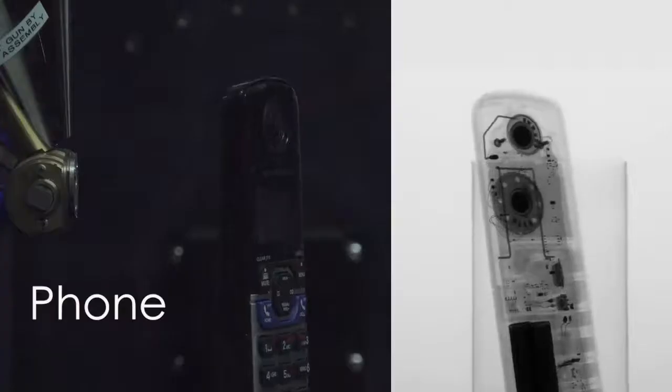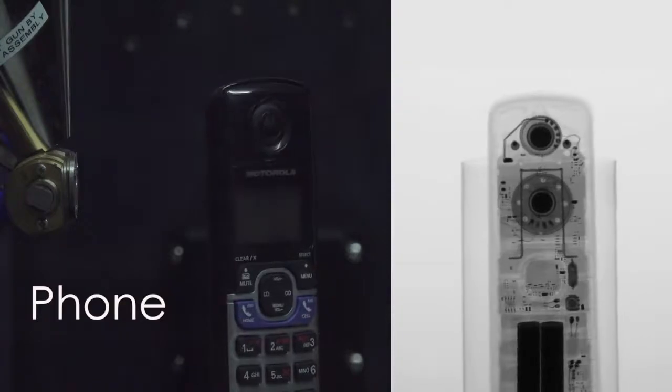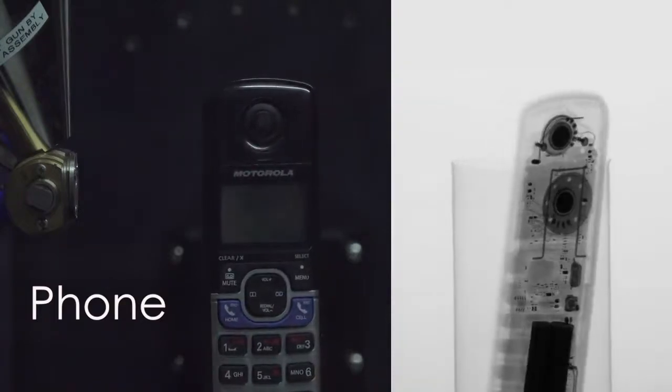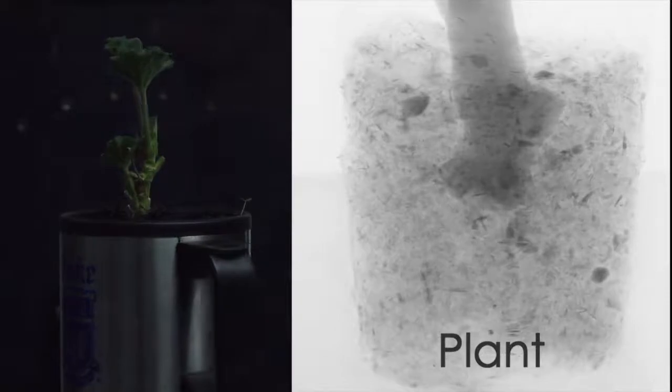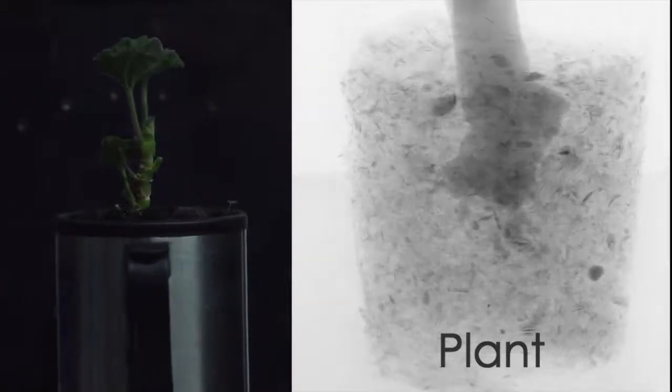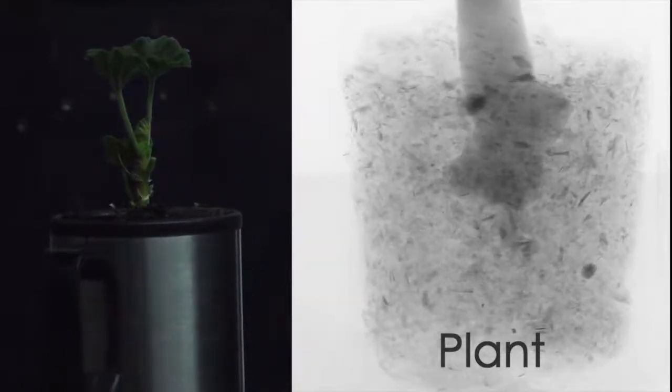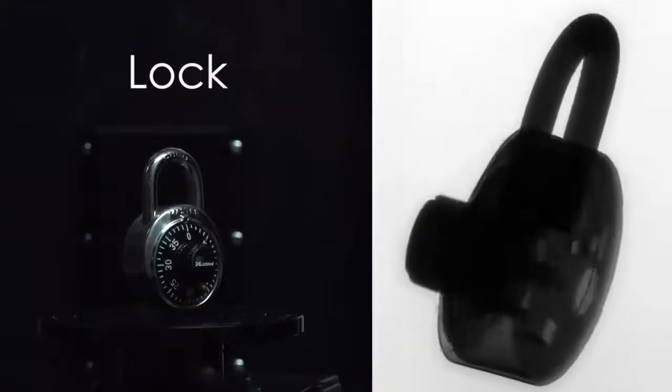The stage that holds the samples in the MicroCT spins around while the rest of the equipment stays stationary. This is unlike a CT scanner in a doctor's office where the machine wraps around a patient.